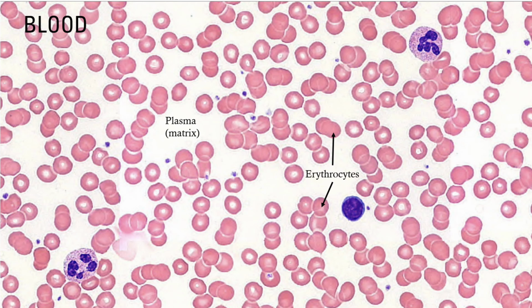The least numerous but easiest to identify due to staining them very darkly are the white blood cells or leukocytes. Do not worry about identifying the individual classes of leukocytes at this point. The final class of formed elements are the thrombocytes. Thrombocytes are small packets of cells that contain clotting factors and stain a dark color.